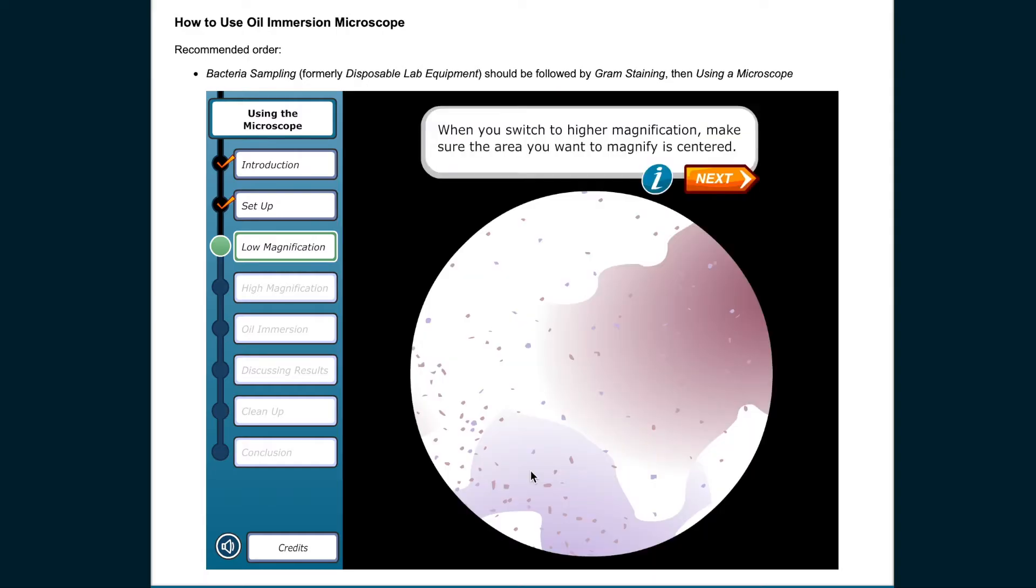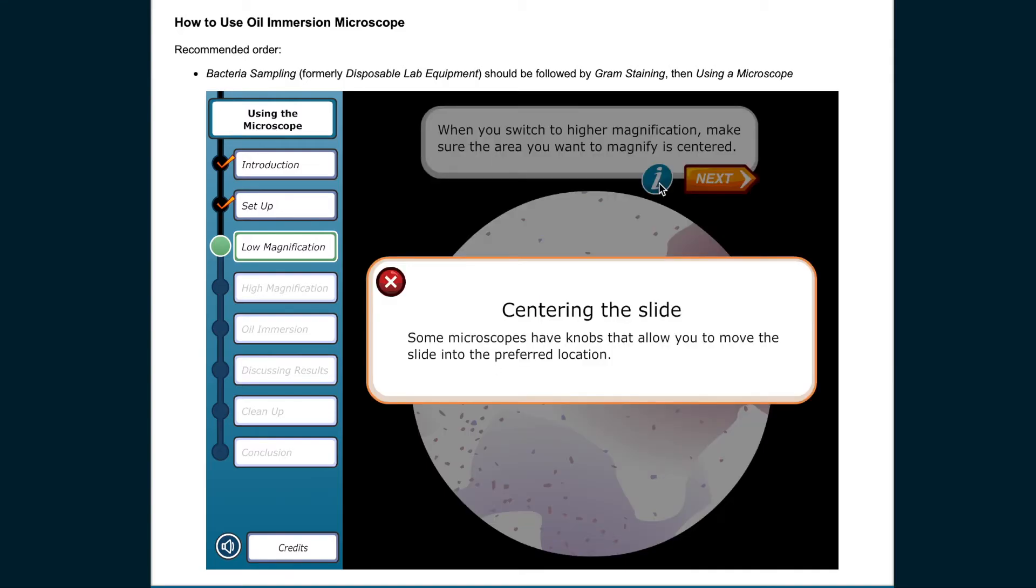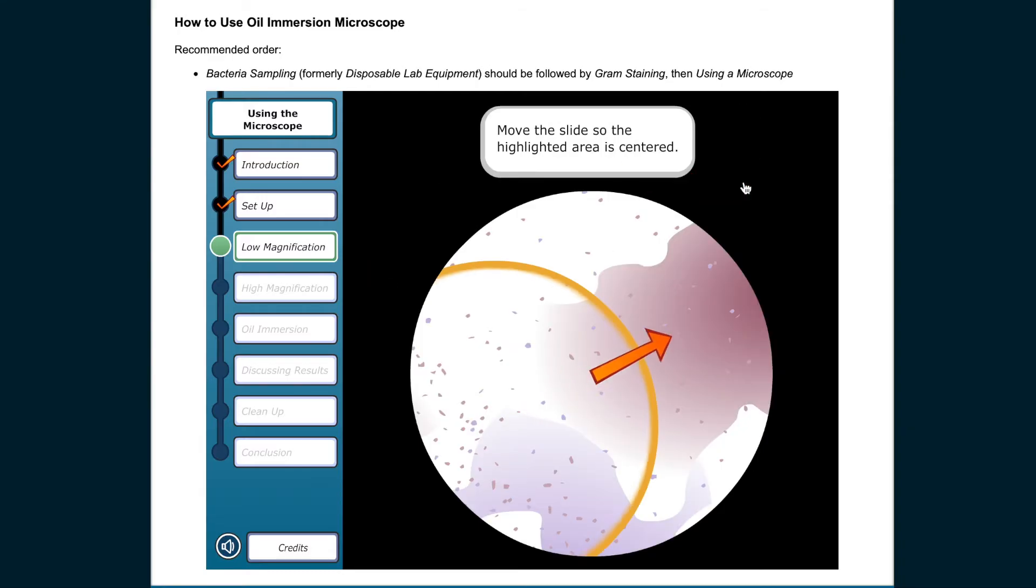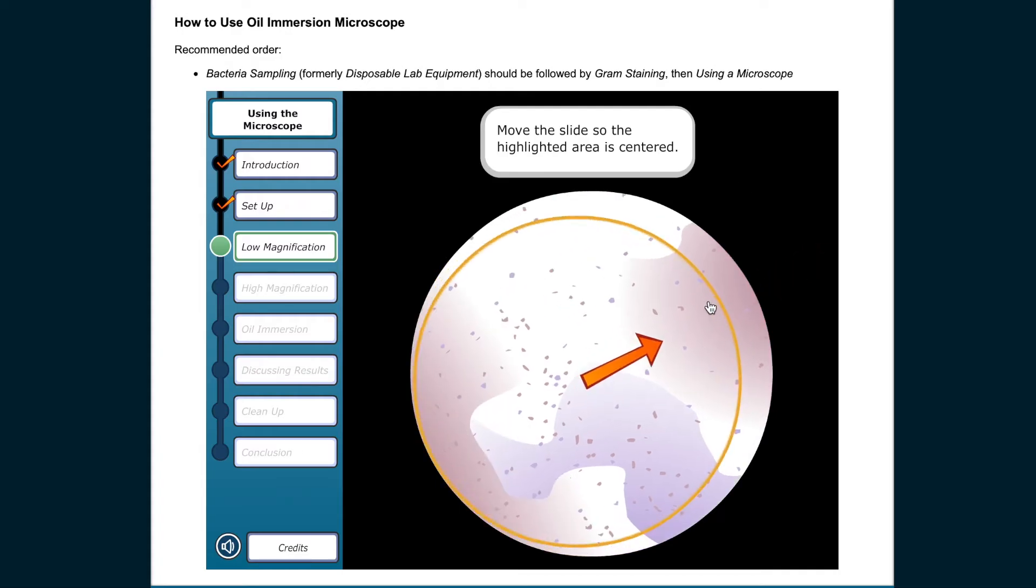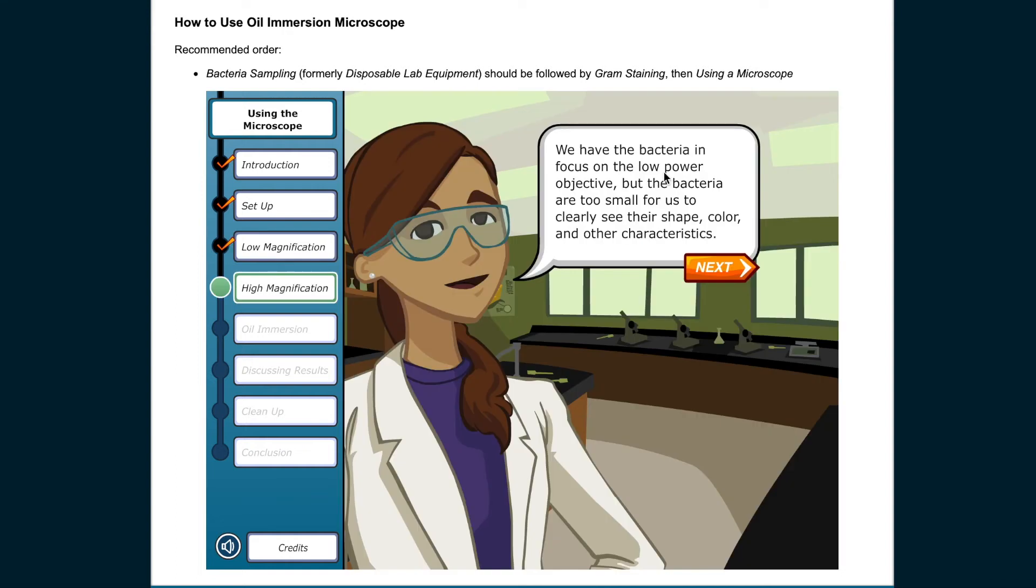When you switch to higher magnification, make sure the area you want to magnify is centered. Some microscopes have knobs that allow you to move the slide into the preferred location. We have the bacteria in focus on the low-power objective, but the bacteria are too small for us to clearly see their shape, color, and other characteristics.